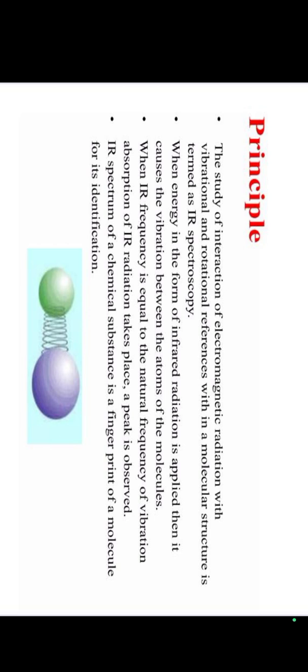When the IR frequency is equal to the natural frequency of vibration, absorption of IR radiation takes place and a peak is observed. The IR spectrum of a chemical substance is a fingerprint of the molecule for its identification. This is the principle of IR spectroscopy.